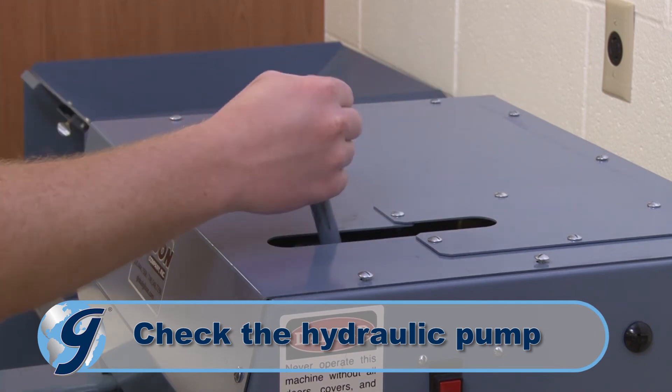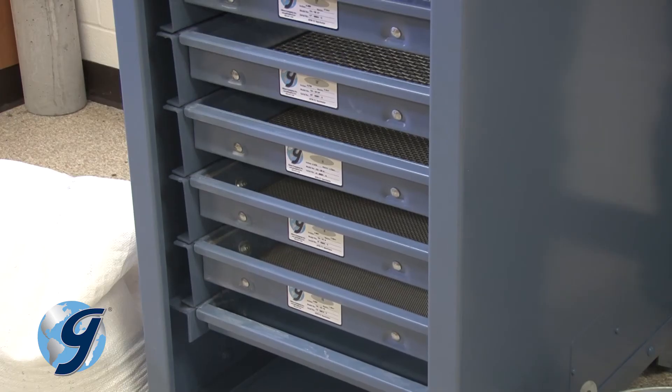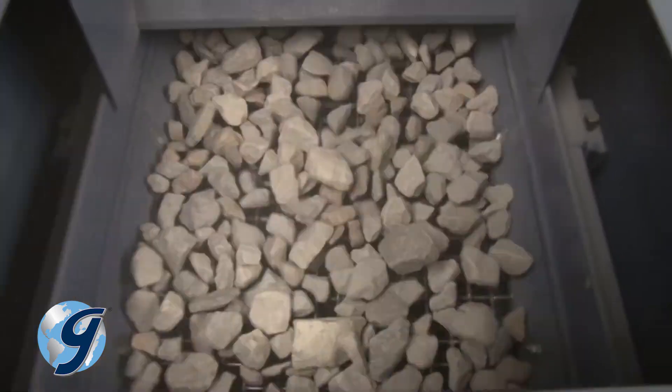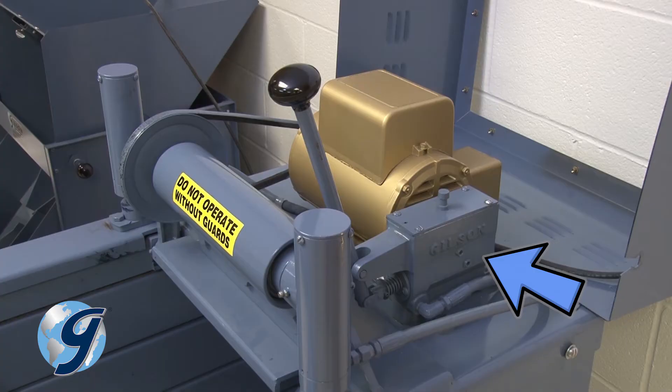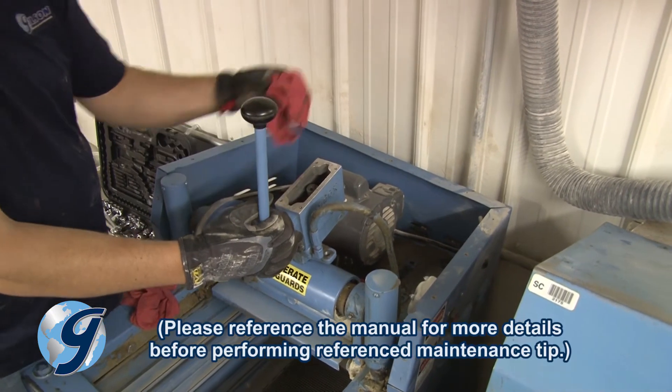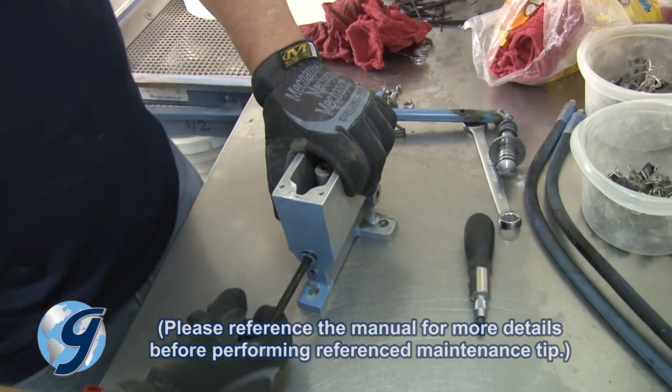Over time, the low pressure hydraulic pump used to clamp the screen trays may wear and develop leaks, especially under heavy use. Excessively worn or damaged pumps must be replaced, but the pump can often be refurbished using Gilson repair kits.